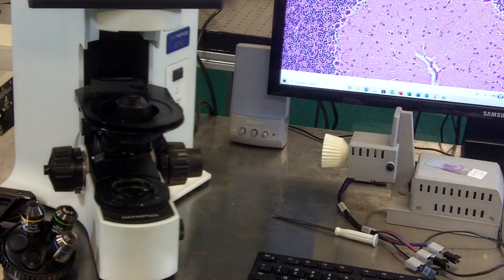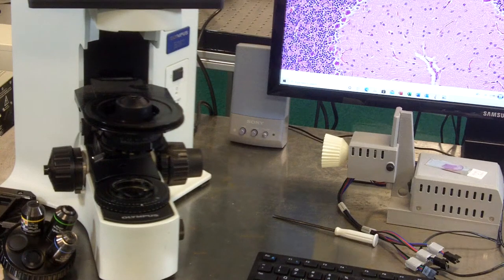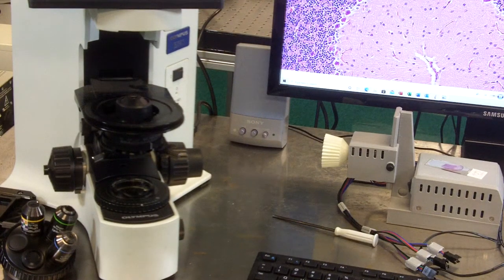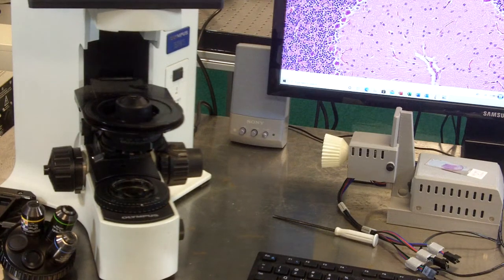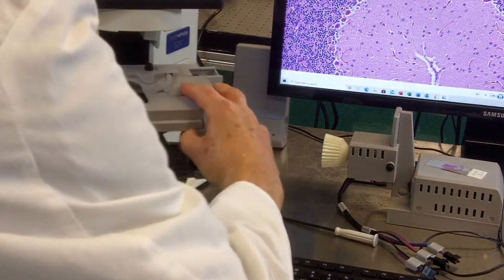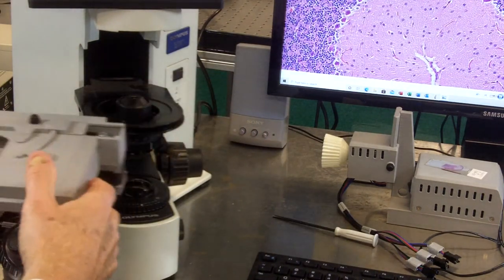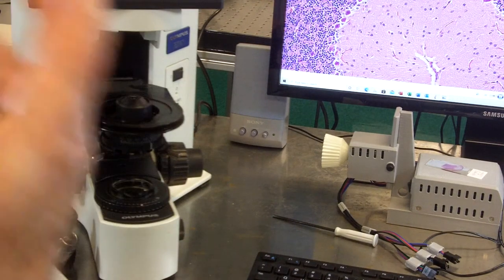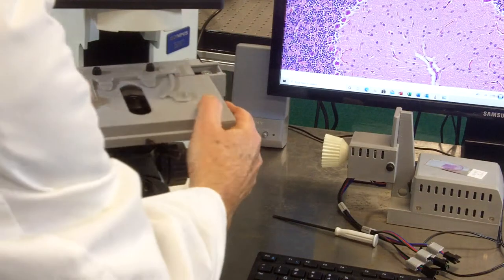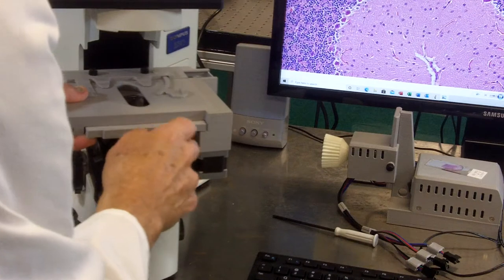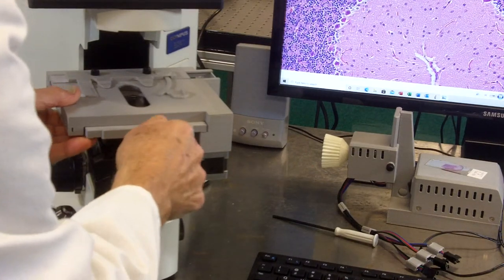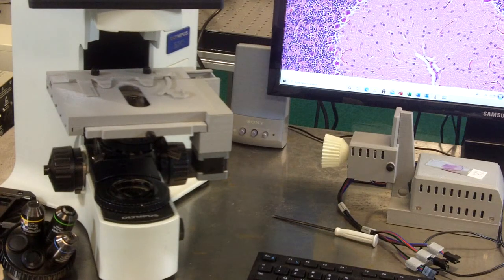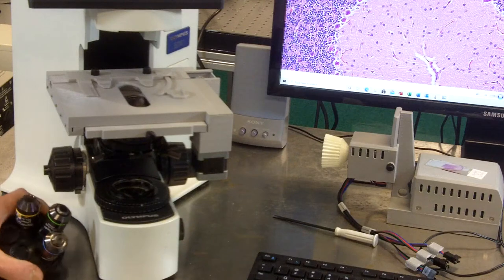What we're going to do now is install the RetroBot stage onto that bracket with the exact same fixture. We have intermediate rings, step-down rings for different makes of microscopes—Nikon, Zeiss, Leica, Modic—and they will simply add onto that existing bracket. Here you'll see the RetroBot stage mounted to the BX41 microscope.